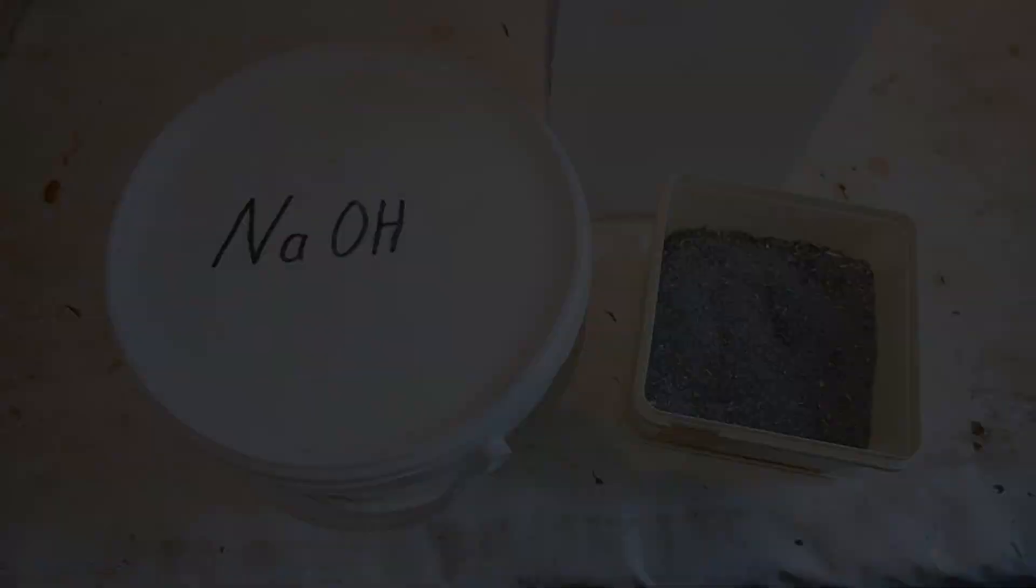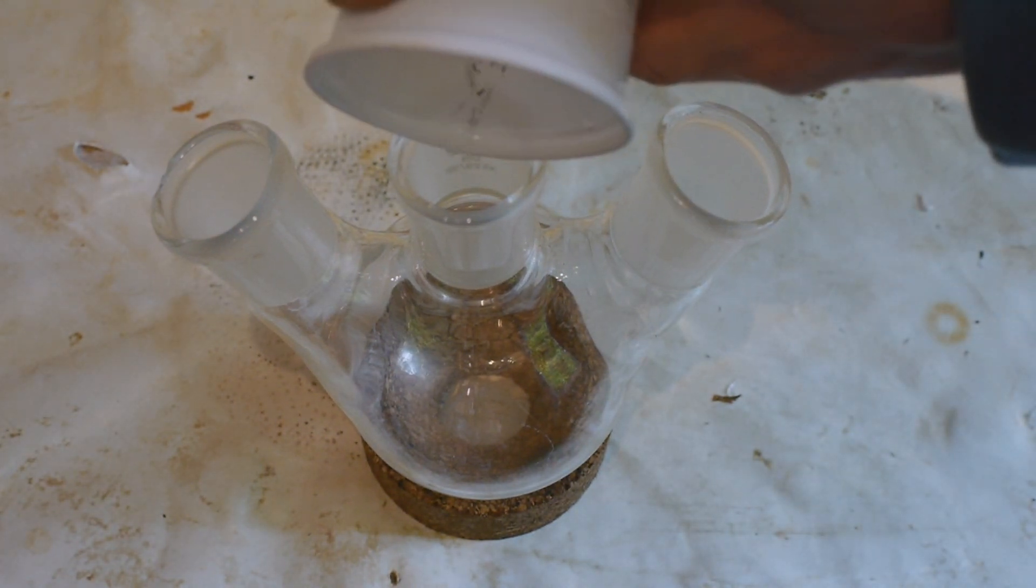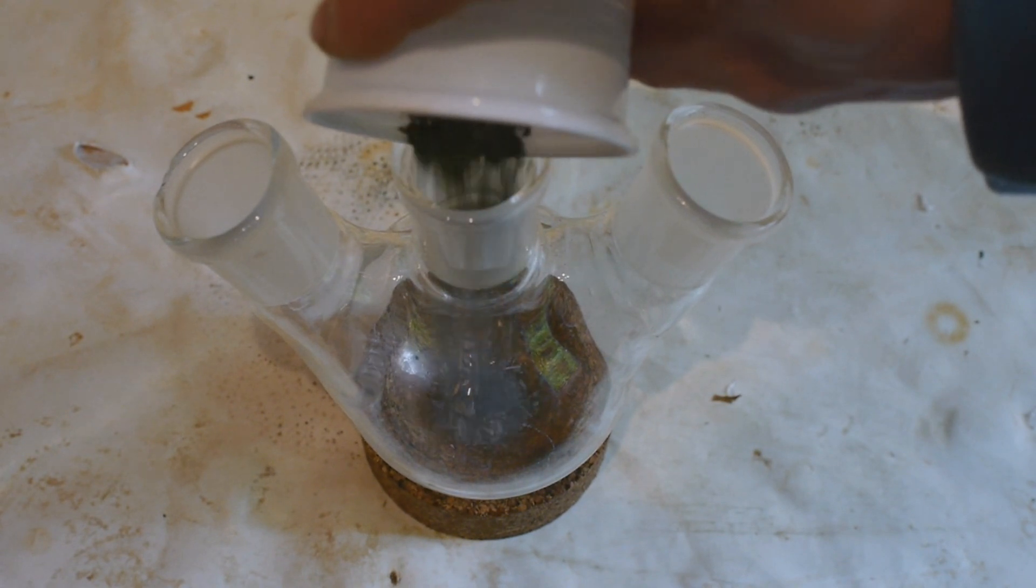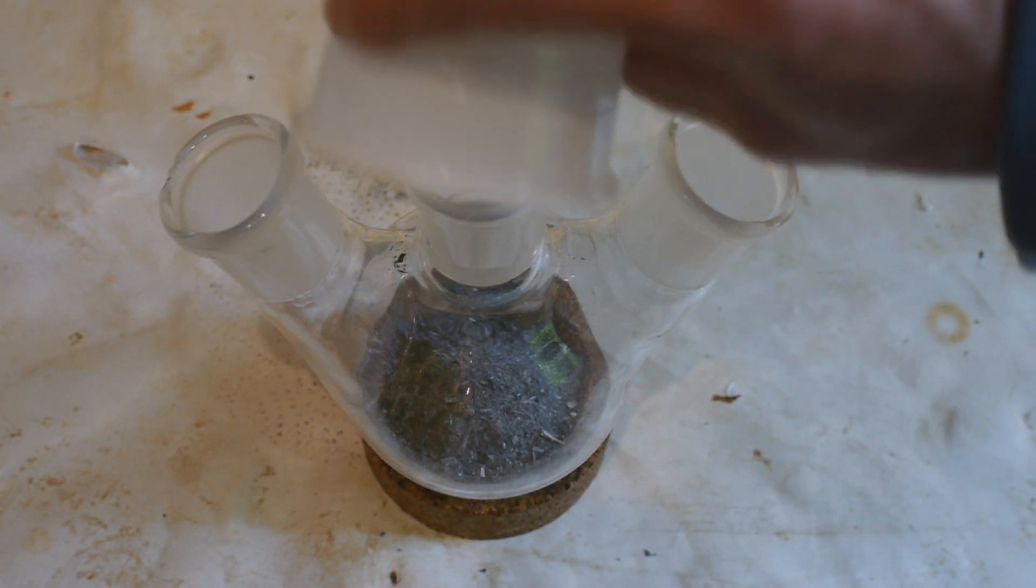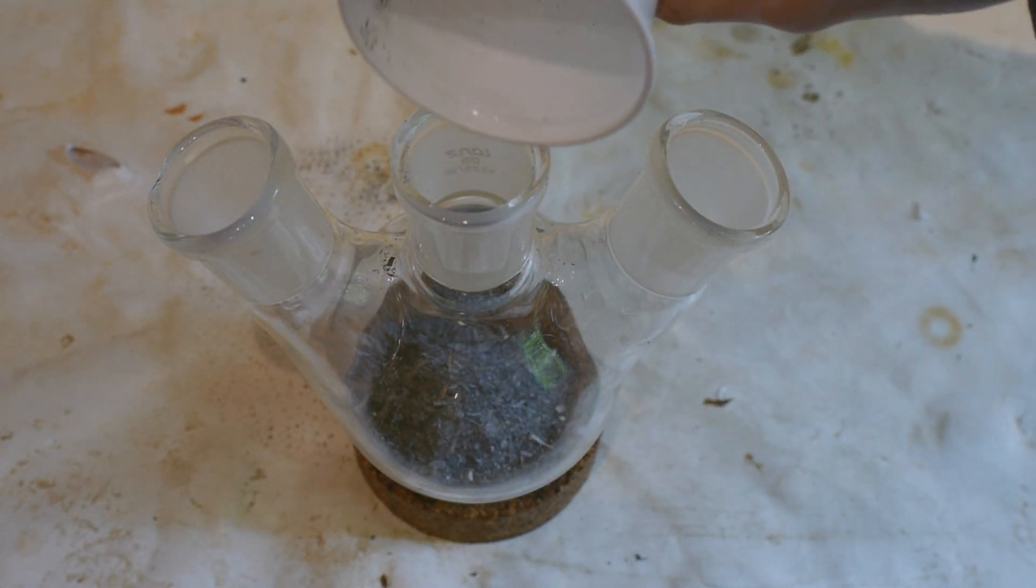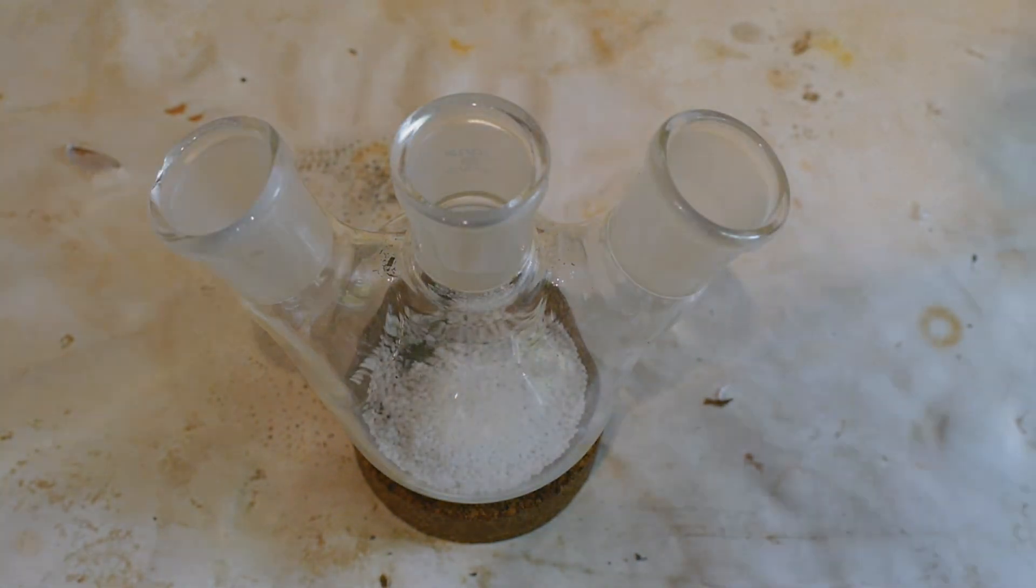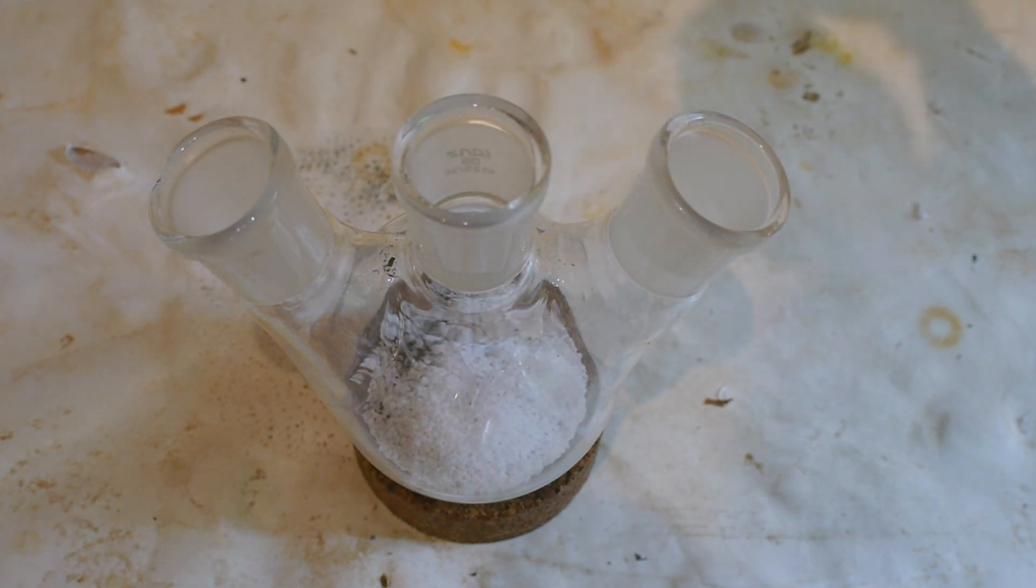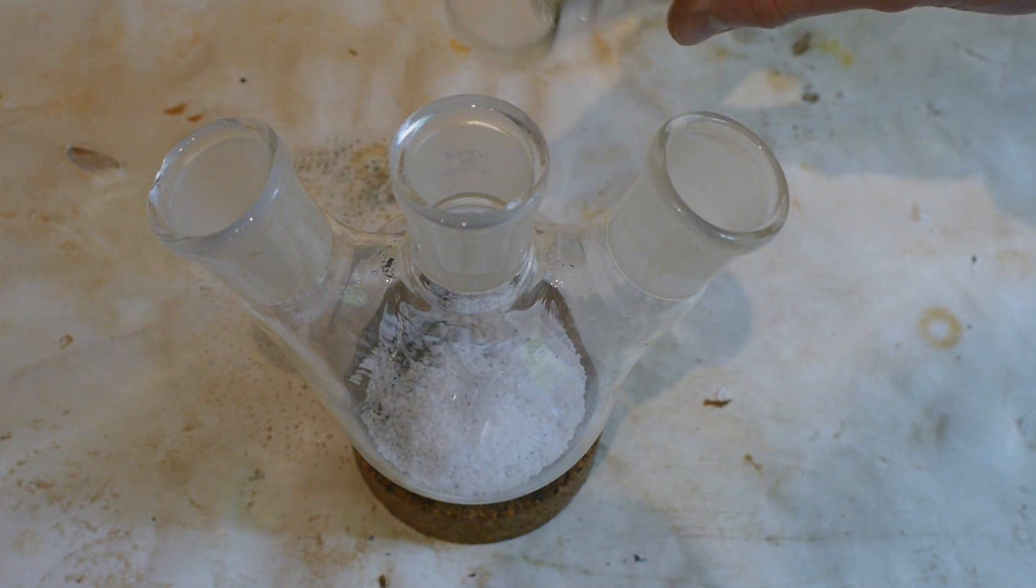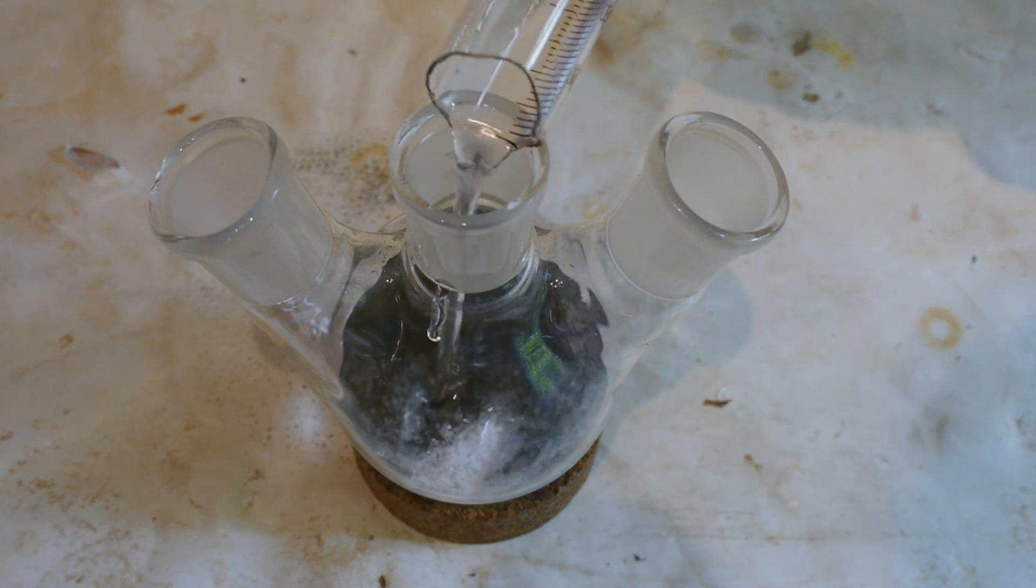As a reaction vessel, I'll be using this three-necked round-bottom flask which has a volume of 250 milliliters. Let's start by charging the reagents. First we're going to start with 14 grams of magnesium metal. To this we'll be adding 20 grams of sodium hydroxide. Then we need 1.5 grams of menthol crystals which smell absolutely amazing. As a solvent we'll use 125 milliliters of mineral oil.